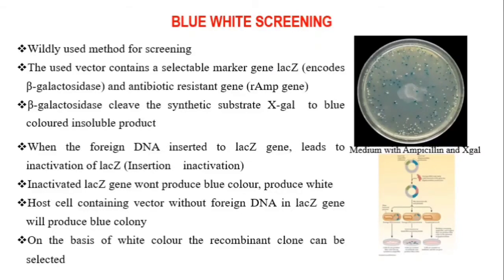That lacZ gene encodes an enzyme called beta-galactosidase. And that beta-galactosidase cleaves the substrate X-gal present in the medium into a blue colored insoluble product.